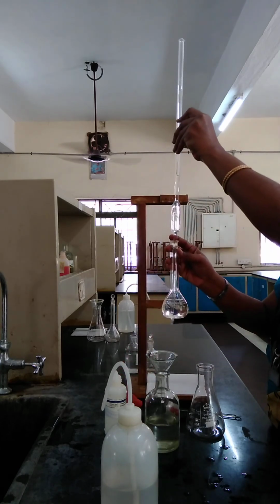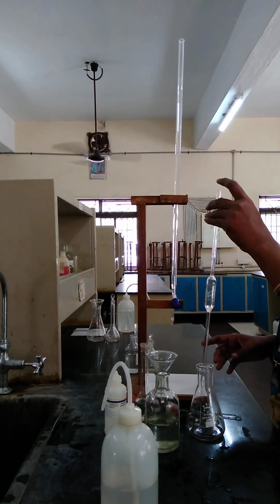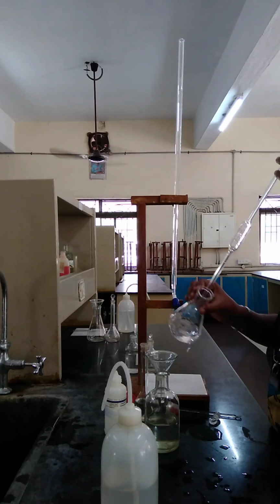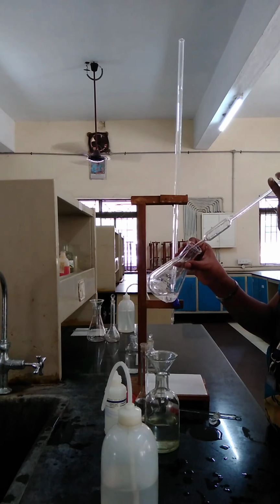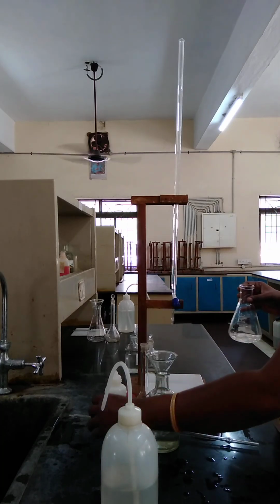Transfer it into the conical flask, which is already washed. Just transfer the HCl. There is no additional reagent. Just dip the tip of the pipette and then take it out. Then go for the addition of indicator, 2 drops.